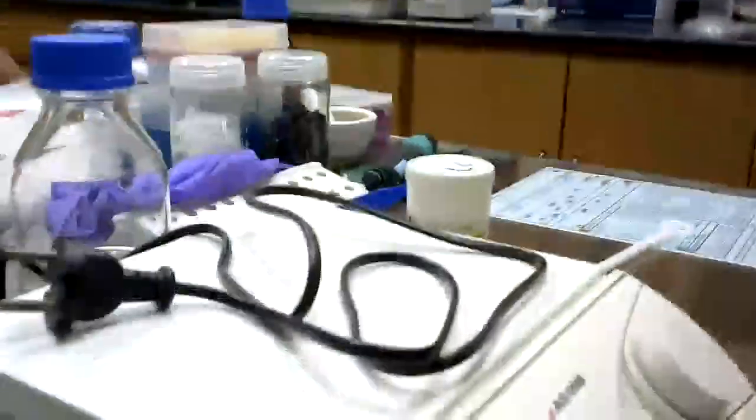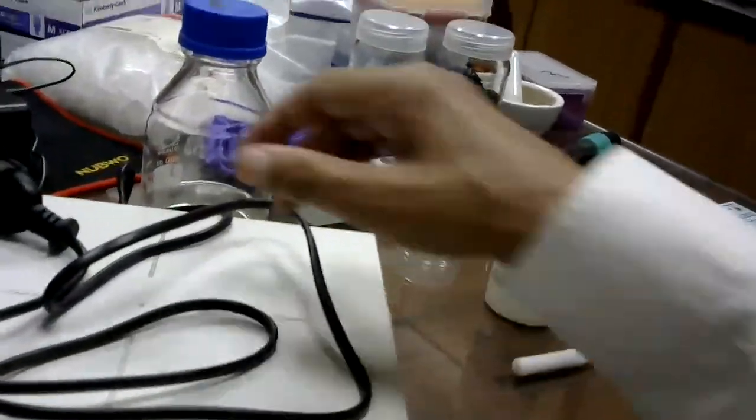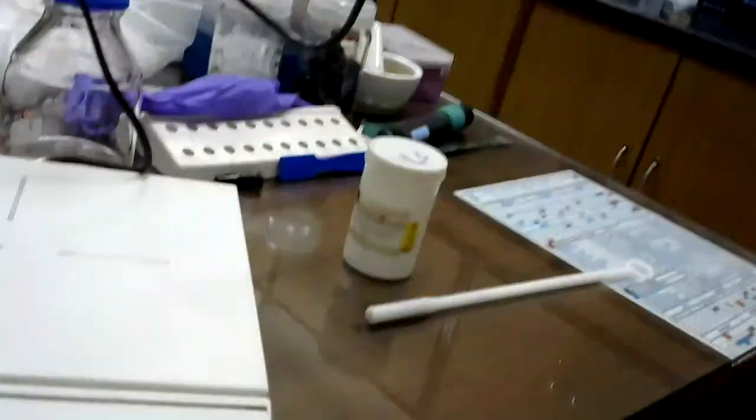Can you bring the magnetic stirrer? So I will again show you. This is a stirrer. You can see this one. This is a stirrer, again working on electricity.